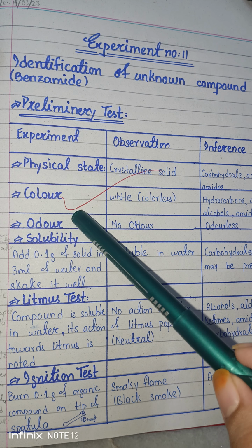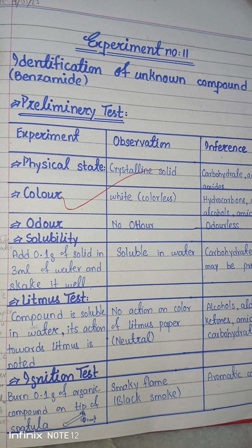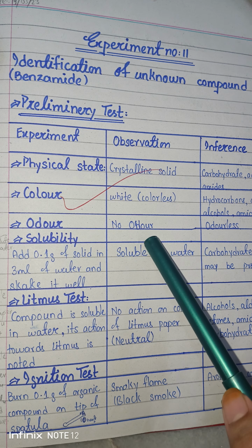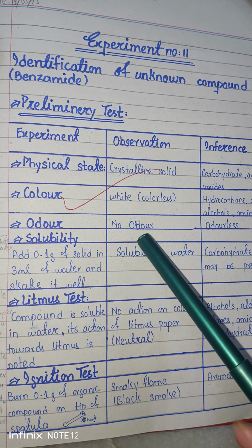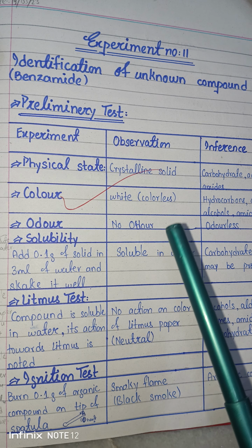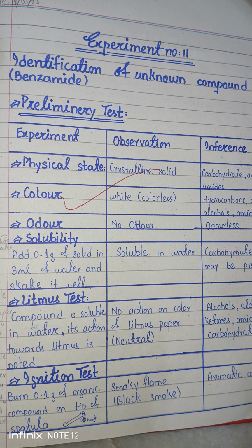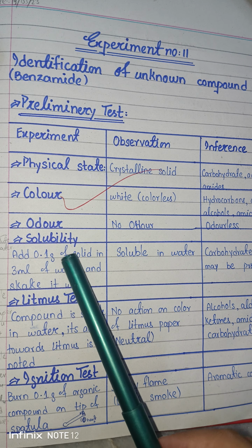Now we discuss the odor. The odor of this compound, it has no odor, so it is odorless. But in the case of benzoic acid, we discussed that benzoic acid has a pungent odor. So this is the differentiation between them, and due to these tests, you will identify whether it is this compound or not. Now you check the solubility.